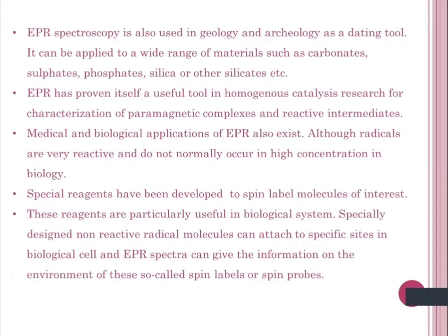Electron paramagnetic resonance has proven itself as a useful tool in homogeneous catalysis research for characterization of paramagnetic complexes and reactive intermediates. Electron paramagnetic resonance spectroscopy is a particularly useful tool to investigate their electronic structures, which is fundamental to understand their activity.